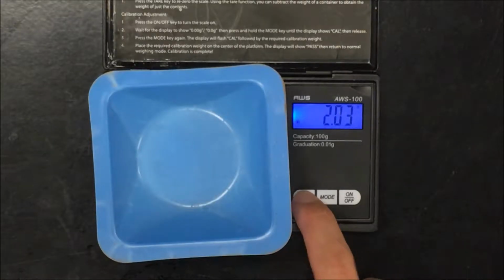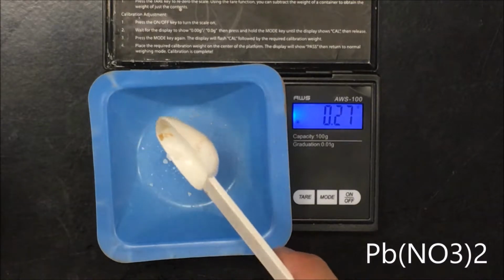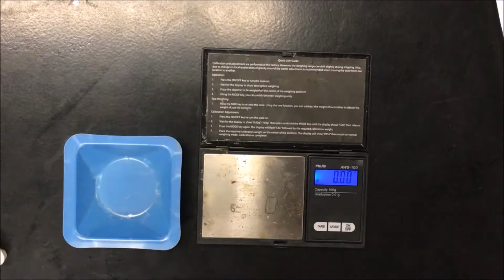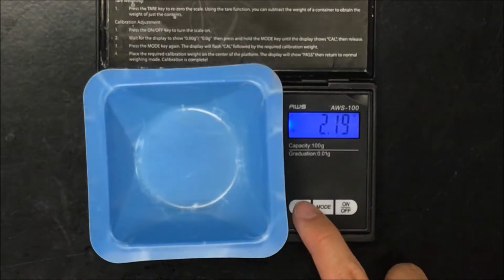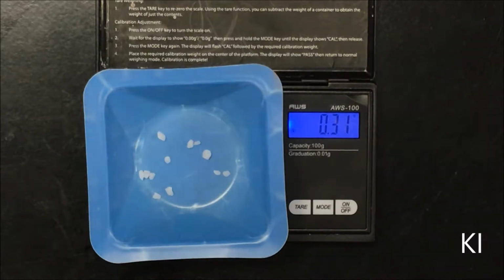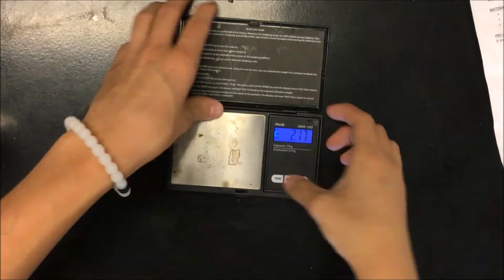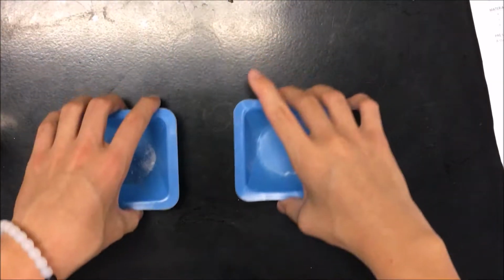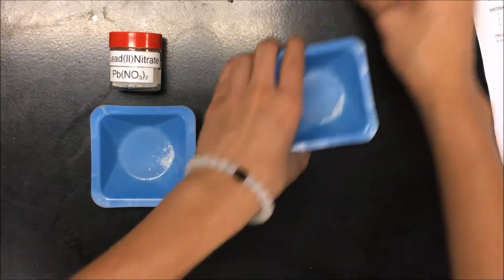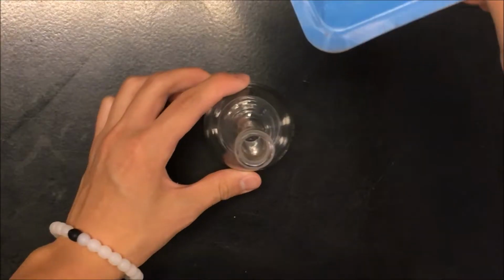To make a 0.01 molar solution of lead-2 nitrate, measure out 0.33 grams. To make a 0.02 molar solution of potassium iodide, measure out 0.33 grams. Now that we measured out 0.33 grams for each compound, we have to make a solution using the 100ml volumetric flask.